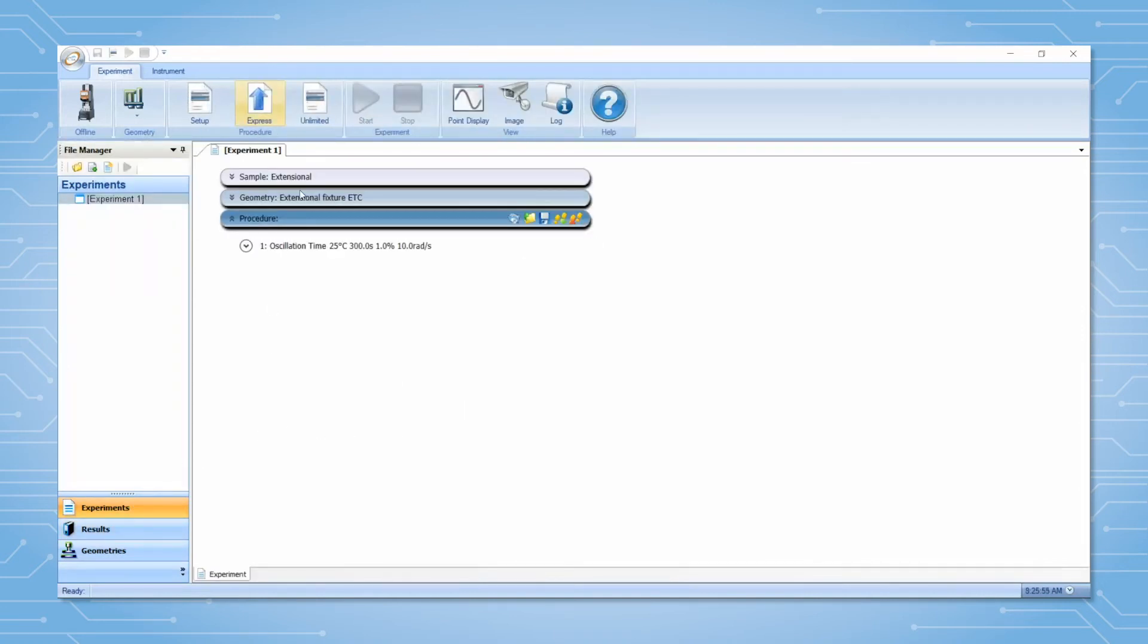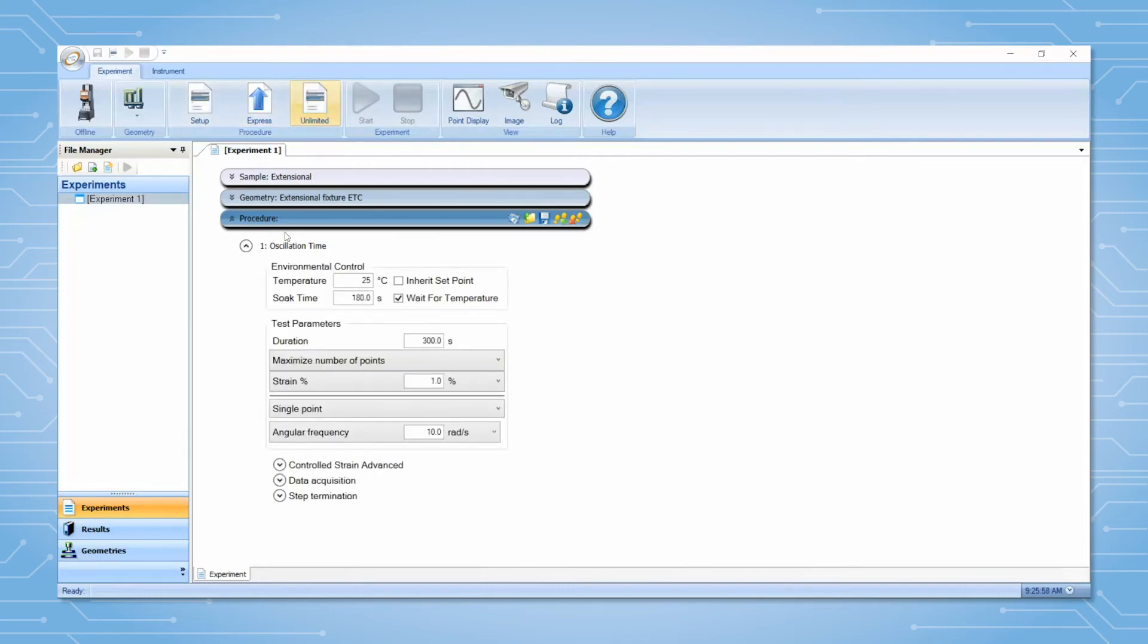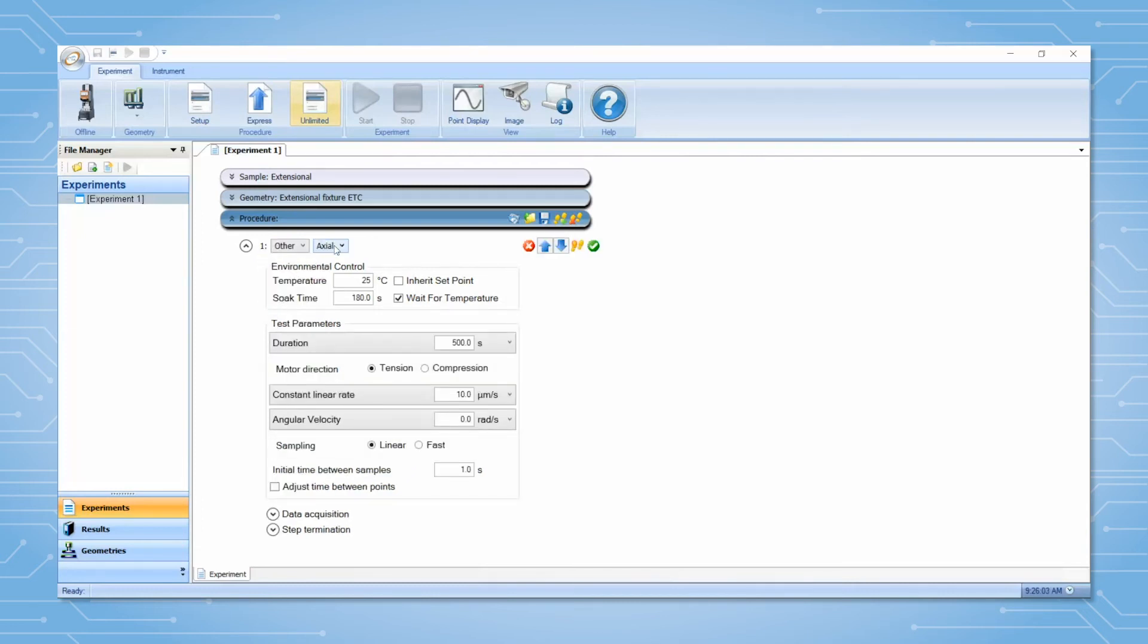The following test should be prepared before the sample is loaded. Set the test mode to Unlimited in the ribbon. The test type is an Other Extensional.